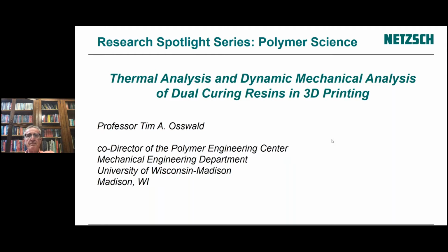Sure. Yes. And from Alec, he did say, I did conduct the thermal expansion experiment. It's just not included in this presentation. And he did comparisons between all the model-free methods and the Kinetics Neo software that you're using. It does make it very easy to do all this. You just select the model from the software. So he did do that. And of course, if there are more discussions on that, you can contact Professor Osswald directly and get that information from him. And we have time.